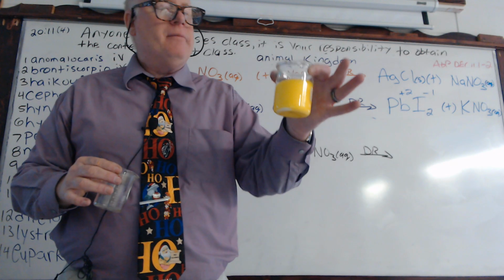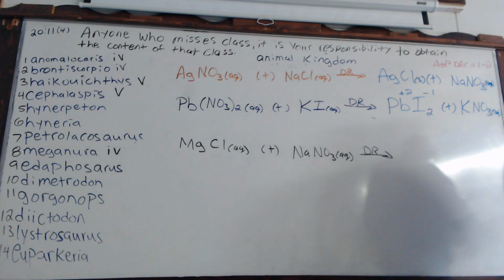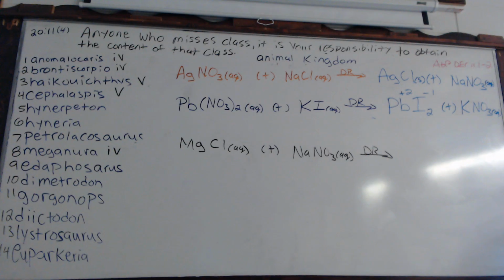It is. Now, you're going to say, well, something like that happened over here as well. Yes, that's true. And even if we leave this over here overnight, nothing's going to change in that solution. But now, we'll just leave this here for a few moments, and you're going to see 2 layers start to form here.